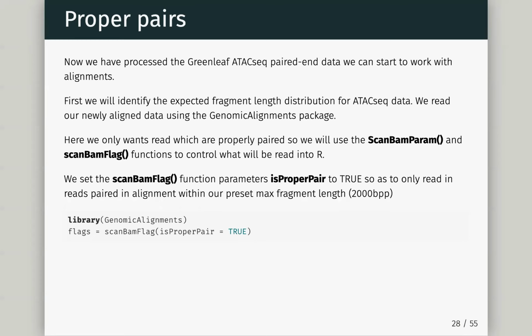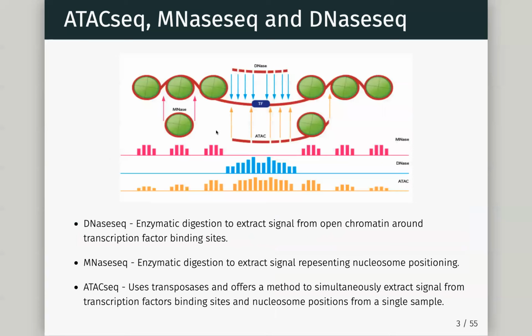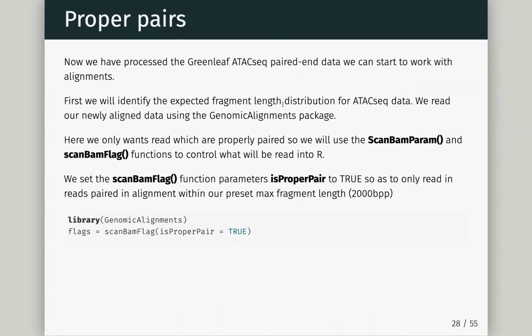And we can expect to see fragments the size of nucleosomes in there. That's because we should have regions coming from around nucleosomes. We should also have regions coming from inside, well, this is the nucleosome sized one here, from inside open regions. So these are also a very important QC for us, and they were important QC for that original paper.